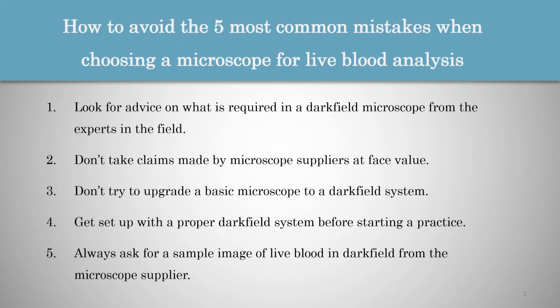It really isn't possible to upgrade a basic microscope to a proper dark field system, and it isn't simply because of the build quality or the optics, but mostly in the first place it relates to the light source. If the light source is not bright enough, it's not going to be suitable for dark field microscopy, and it's also not really possible to replace a weak light bulb with a stronger one. We've seen that previously where practitioners try to upgrade a 20-watt halogen system by inserting a stronger light bulb, which causes problems. And unfortunately, there are no LED light bulbs that can simply be used in a halogen system that produce enough brightness for dark field.